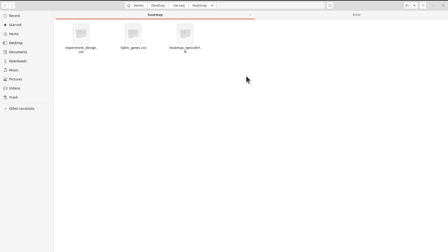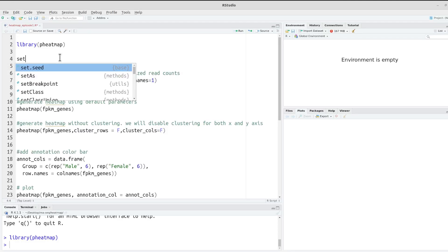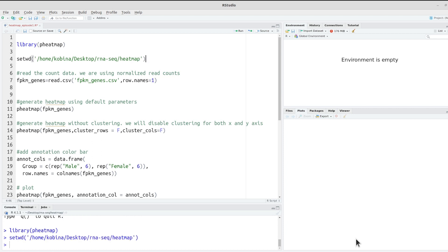I want to set this directory as my working directory in R, so I'll use setwd() and specify the path of that directory. That is done. Now I'm going to read the data using this command.